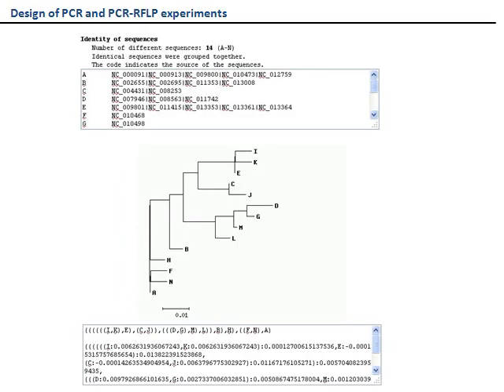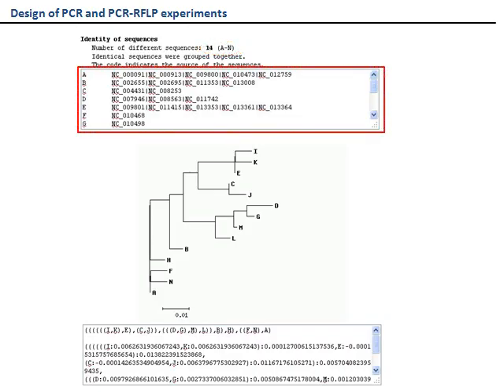In the upper part of the page, the number of different sequences is shown. In this example, the 29 amplicons, each one from one E. coli genome, are grouped to yield 14 different sequences, from A to N. The groups are identified in the text area.